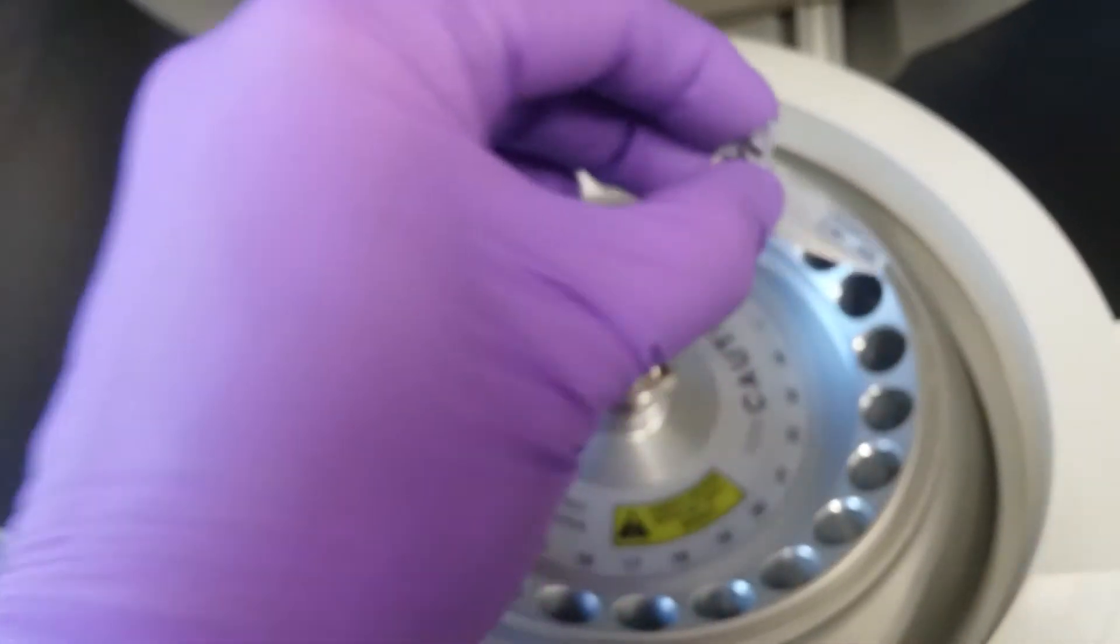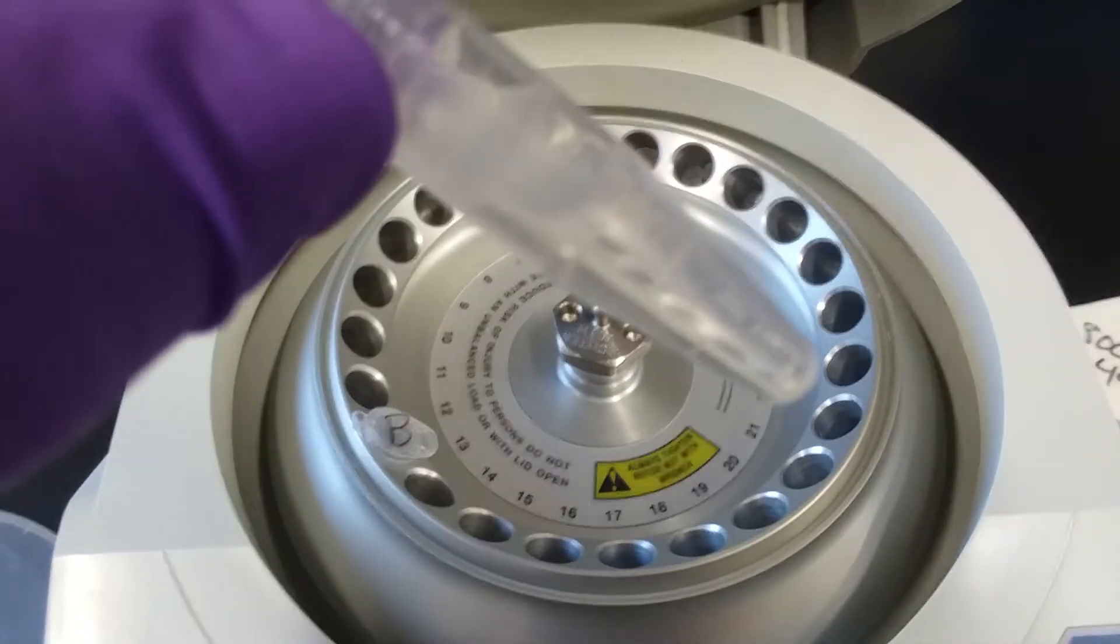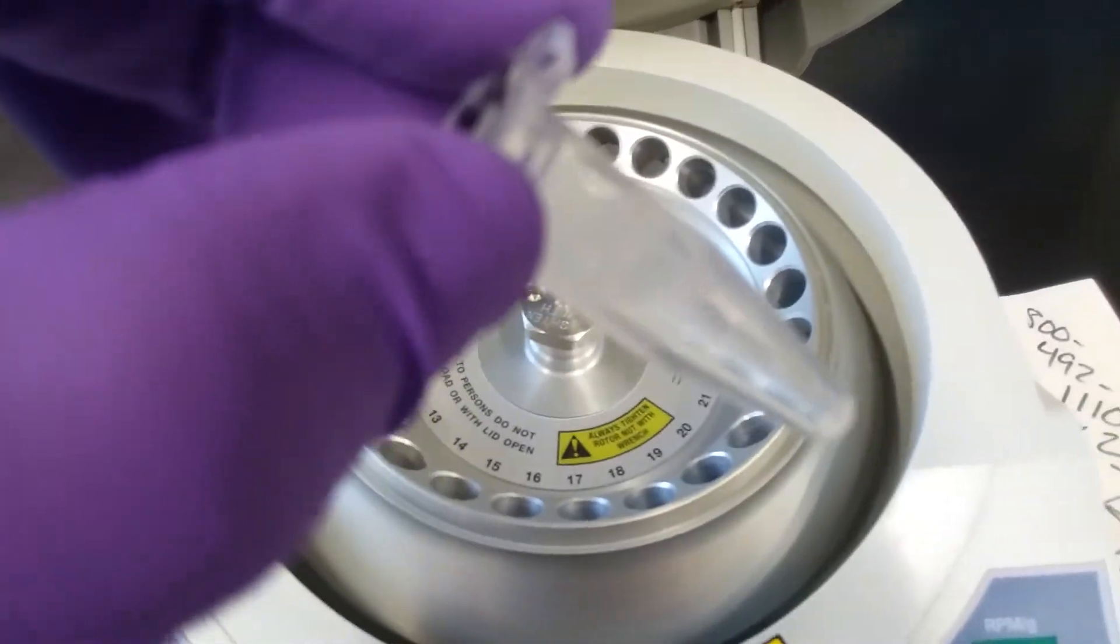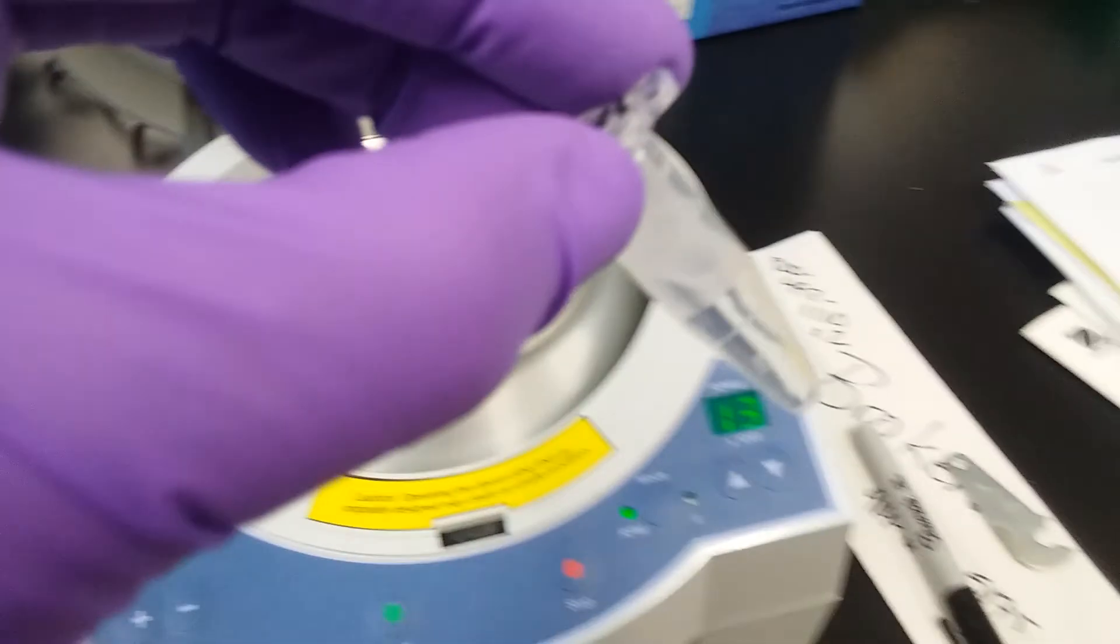And now my spin is done, and you'll either see a pellet, which I'm not seeing, but it would be on that side of the tube, and that's the stuff we don't want.